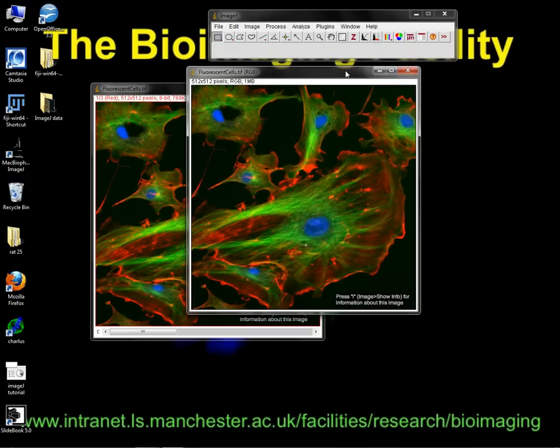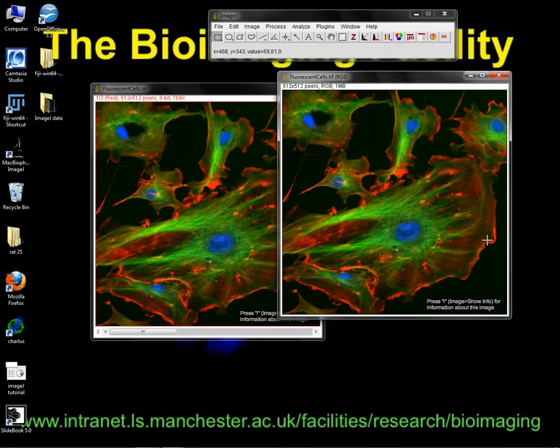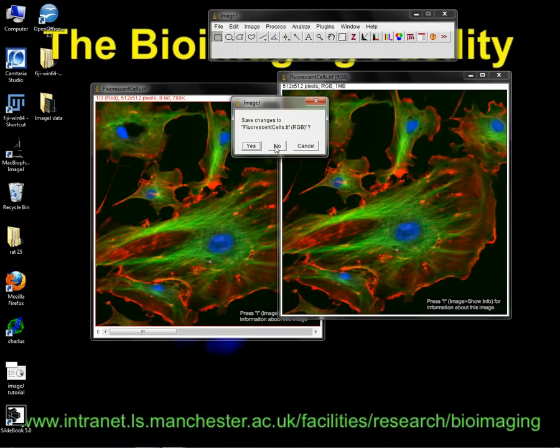But any time you do image processing, if you're going to compare two images that you acquired, your control and your experimental, you can do anything you want to them to make them look the same, or adjust them to make them look different. Your data analysis would be best done on the raw figures, not the montage of it. That's your end point looky-see. Your numbers would always be the same, regardless of what the image looked like, unless you applied it, because that would then save the different display.